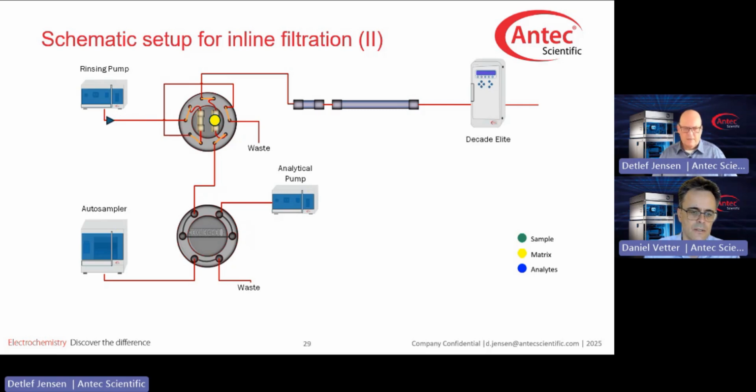Very good question. There is a major difference between manually used filters and these inline filters. These inline filters are constantly in a flow-through situation. They are always rinsed, always being flushed. So the risk of cross-contamination is minimum. I would even go so far to say if everything is being set up correctly, that you have no risk. I saw applications with several hundred, several thousand injections, no cross-contamination whatsoever.